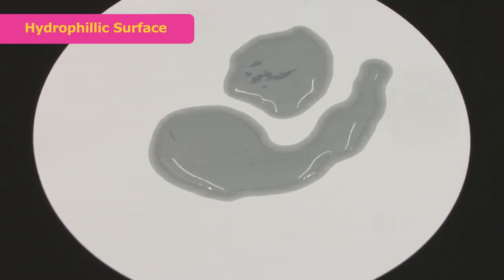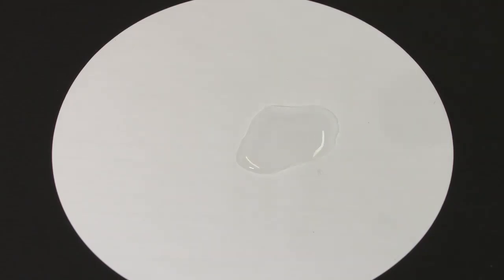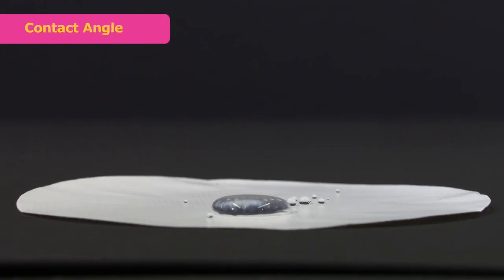The water-surface attractive force varies by degree depending on materials. By putting water on another hydrophobic surface, this time unmodified PVDF, we see the water beads up, but not as dramatically as on the PTFE membrane. This shows, although both PTFE and PVDF are hydrophobic, the PTFE is more hydrophobic. The measurement of attractive force between liquid and surface is called contact angle. Surface tension and contact angle are two of the key variables affecting capillary forces.